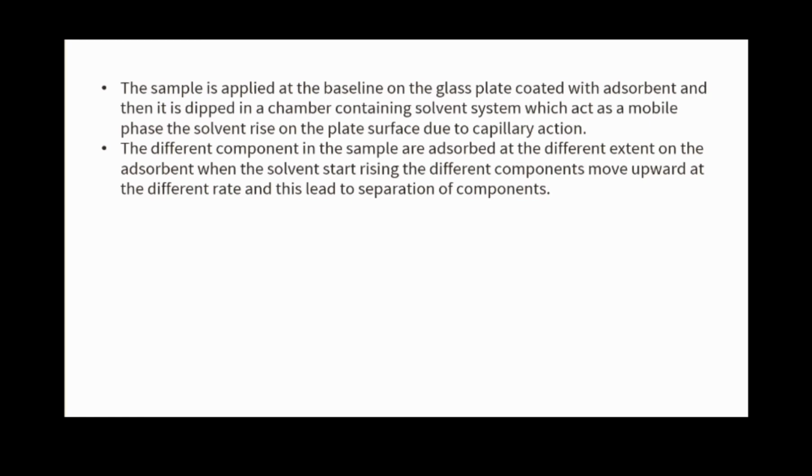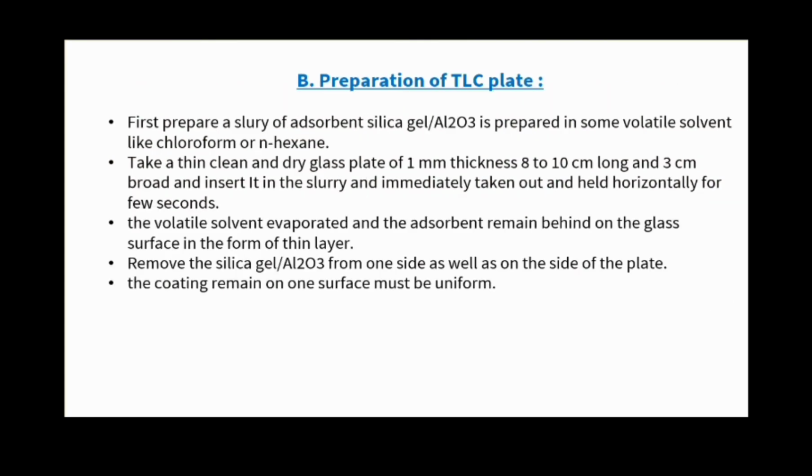The solvent rises on the plate surface due to capillary action. The different components in the sample are adsorbed to different extents on the adsorbent. When the solvent starts rising, the different components move upward at different rates, and this leads to separation of components. So next point is preparation of a TLC plate.